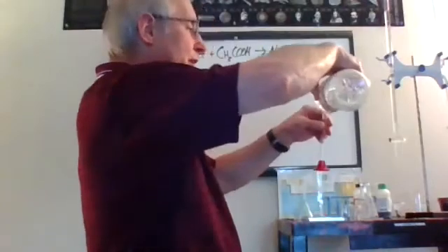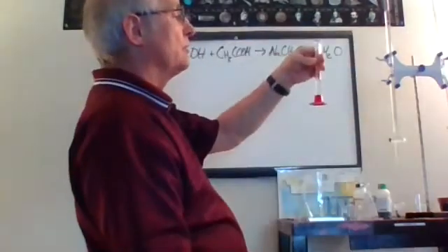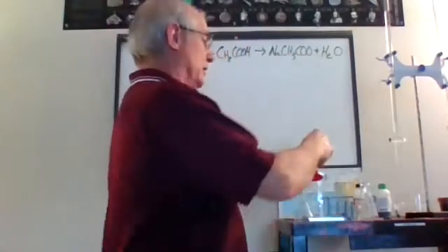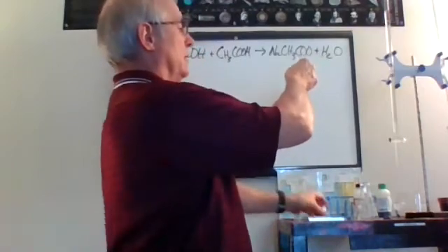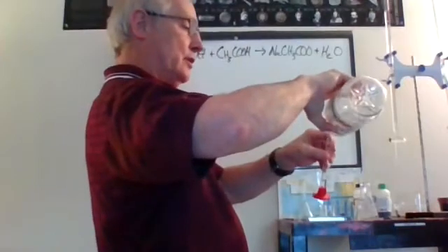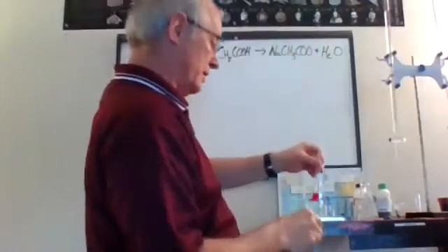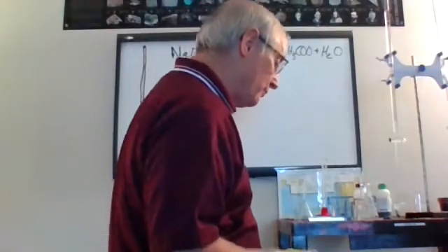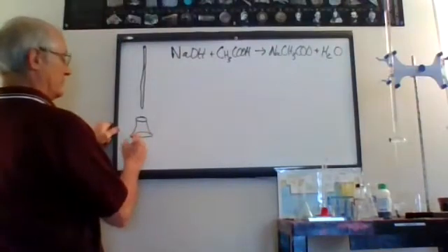Well, let's go ahead and pour it over here. Oh man, that's 4.5. I'm going to go ahead and stick a little bit in here. I want a little closer to 3. Now it's 2.5. You know what I need? I need a little dropper. That would take care of this problem. Okay, it is exactly 3.24 grams of mass. This is the vinegar.